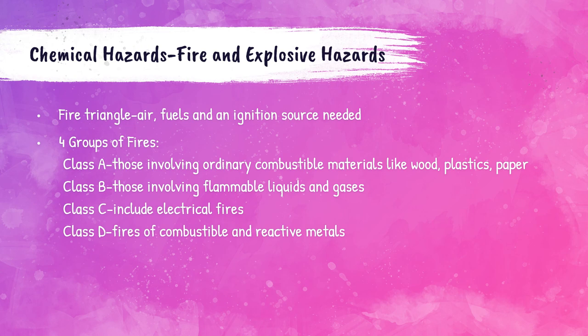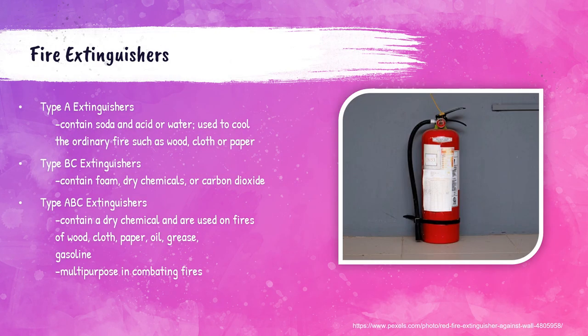Fires are also a hazard in the laboratory. There are four classes of fires: Class A fires are caused by ordinary combustible materials such as wood or paper; Class B fires are caused by a vapor-air mixture over flammable solvents such as gasoline or grease; Class C fires occur in or around electrical equipment; and Class D fires involve combustible metals such as magnesium or lithium. Type A extinguishers contain water or soda acid and are used to cool Class A fires. Type BC extinguishers contain carbon dioxide, foam, or dry chemicals. Type ABC extinguishers consist of a dry chemical and serve as a multi-purpose extinguisher for wood, cloth, paper, oil, grease, and gasoline fires.